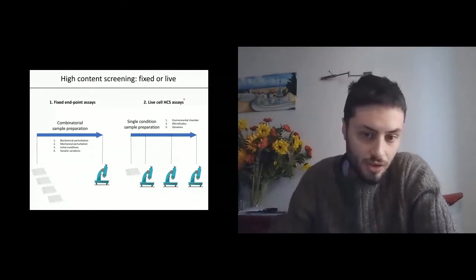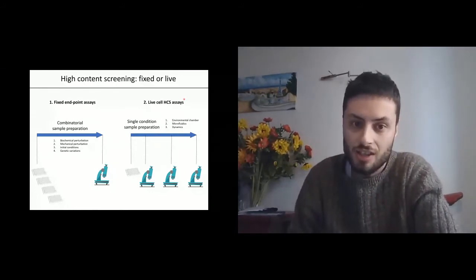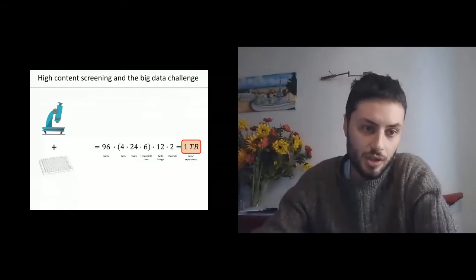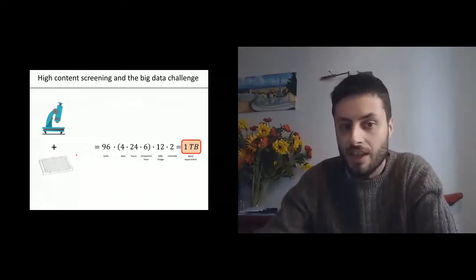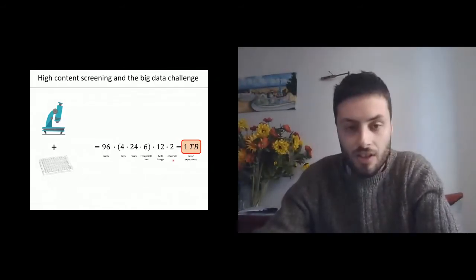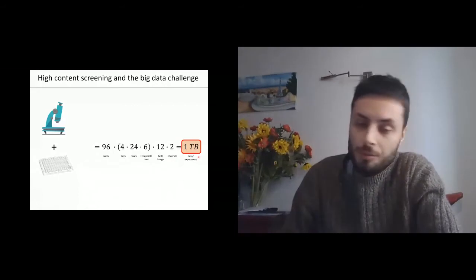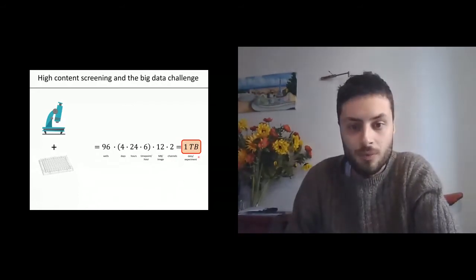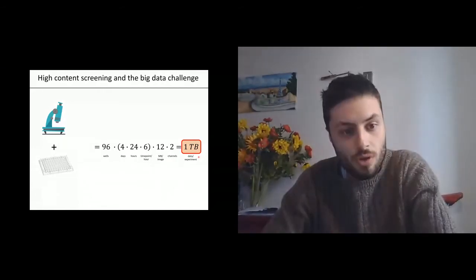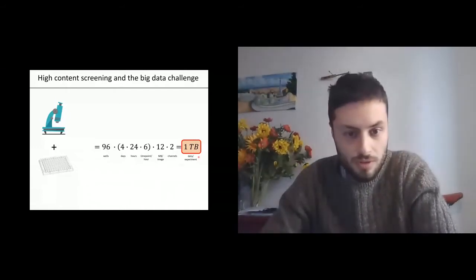I would like to point out that no matter which one of the two one is interested in or is using, there is a very important challenge that one needs to address, which is that of big data. If you imagine imaging a single 96 well plate for several days, every 10 minutes, in two different channels, which could be, for instance, bright field and fluorescence, one ends up with already approximately 1 terabyte of data. So obviously the challenge is to manage and explore your data, to create biological knowledge from it using application software and bioinformatics software tools.